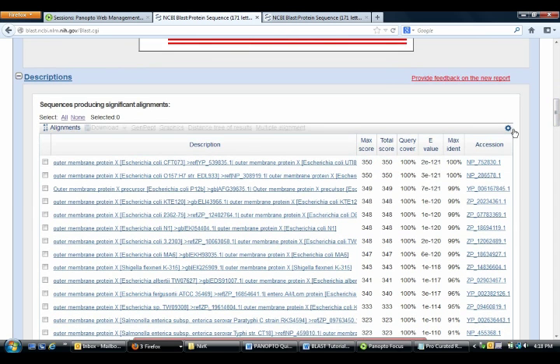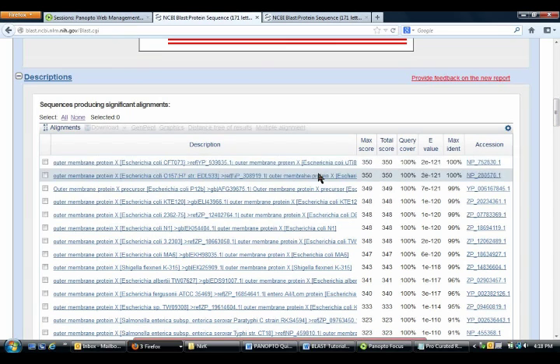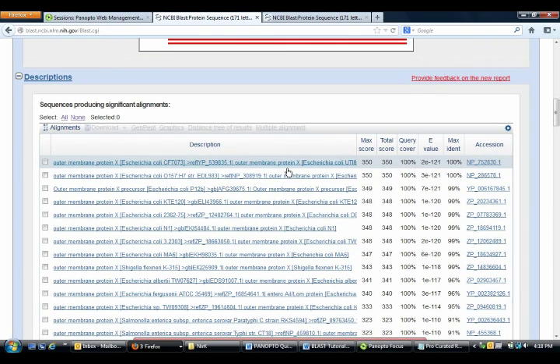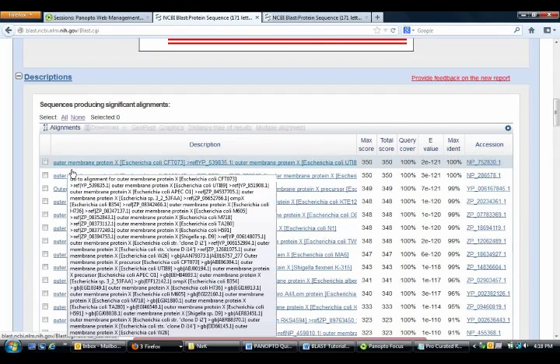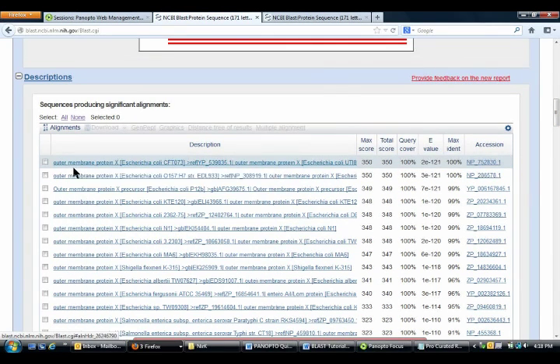under descriptions, it will give you some information about your protein. In this case, we have identified outer membrane protein X.